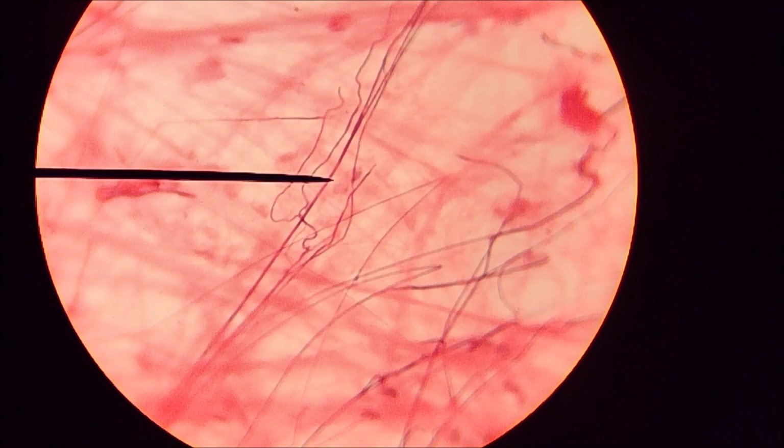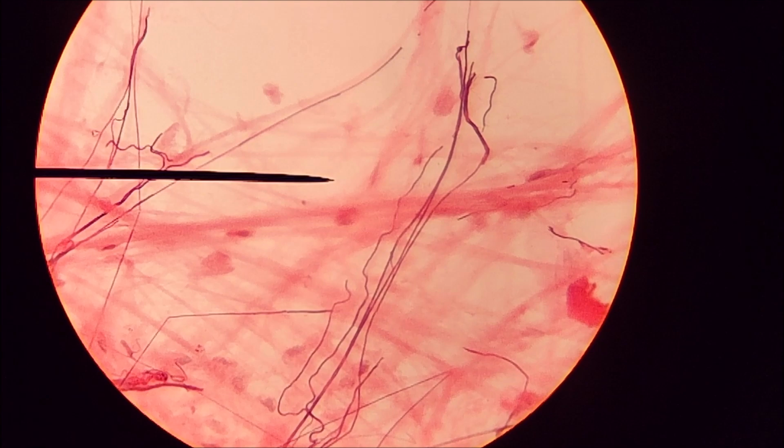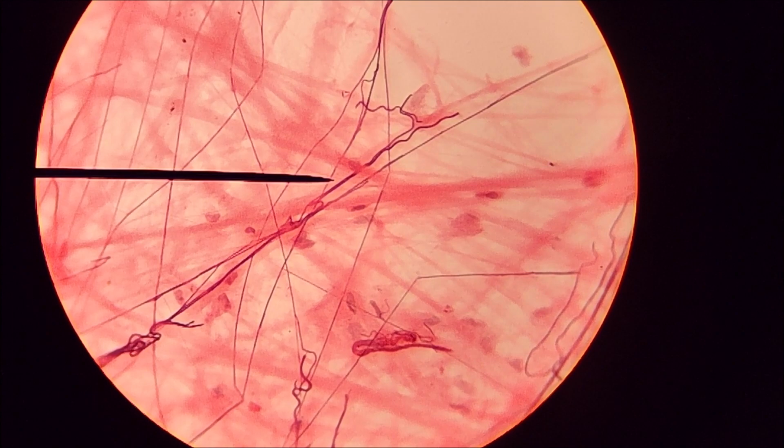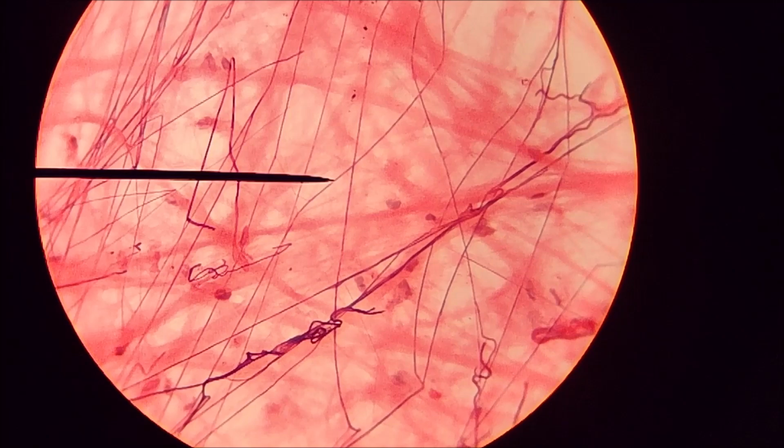All the clear space would be the ground substance. And in the background, you can see these pink fibers, like this one here. This big, thick pink fiber, that's collagen. So the purple ones in the foreground that are thin are elastic fibers, and the pink ones that are thicker in the background are collagen fibers. So this is a good areolar connective tissue.